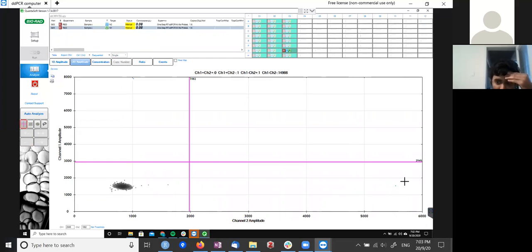But you can see one point here. That means that's a normal droplet fluorescence. If that well has a huge load of inhibitors or something, then it might bring this whole point down to here. But that doesn't generally happen.